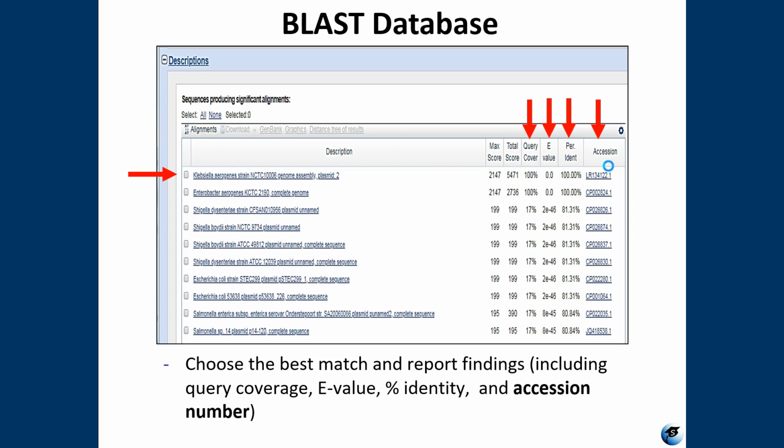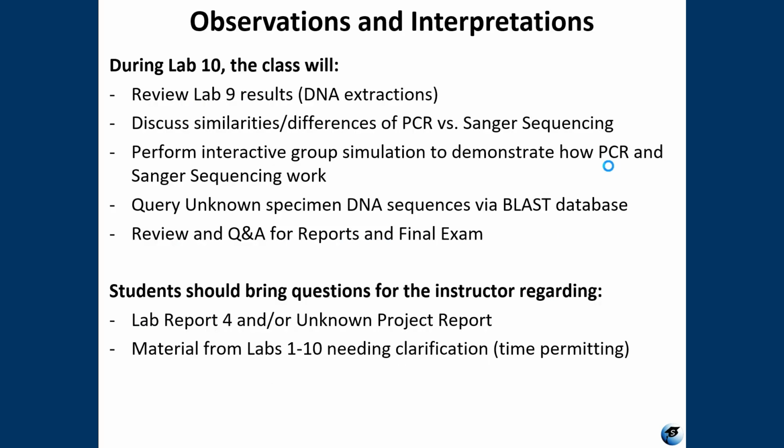I will talk to you some more in class and also in the report video about how to cite the BLAST database. There is a very specific full citation that you should use in your lab reports, so I want to make sure that we go over that.